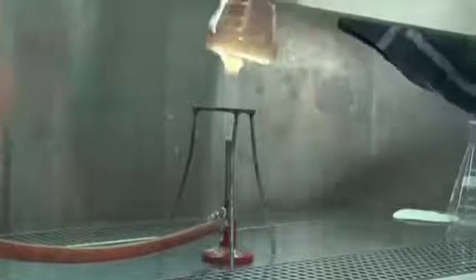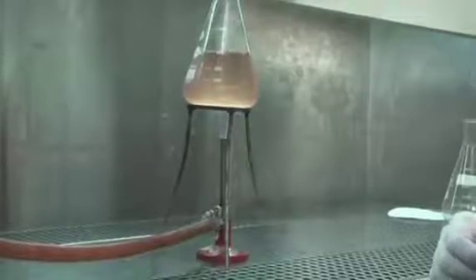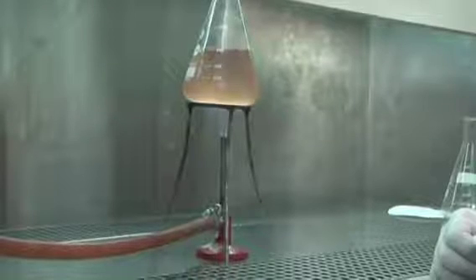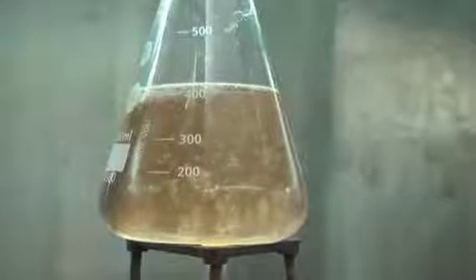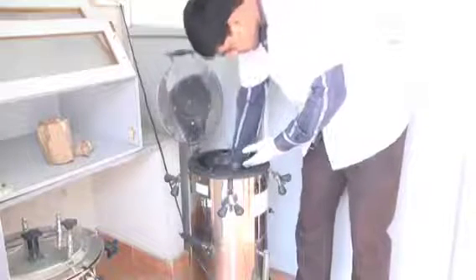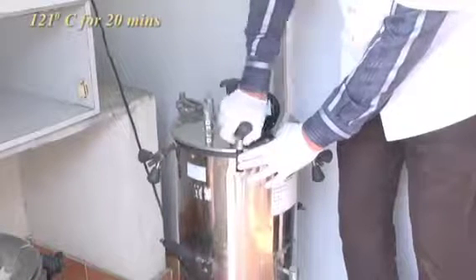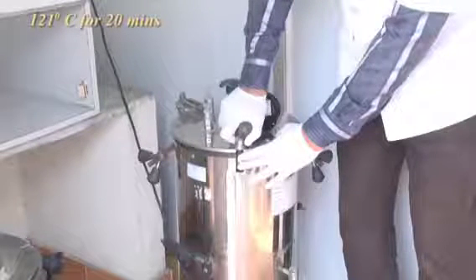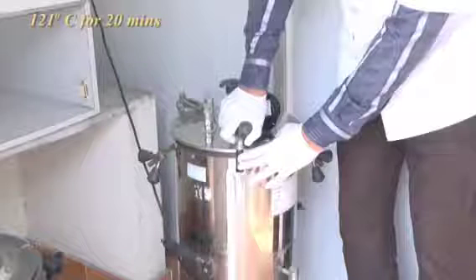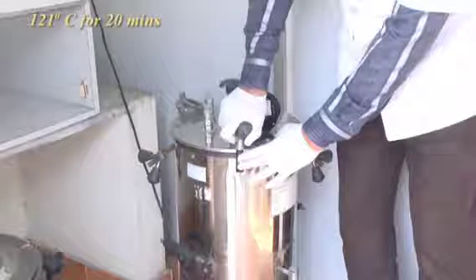Media containing agar should be heated first to completely dissolve the agar before autoclaving. Bring the medium to a boil without burning. Most culture media will require final sterilization in an autoclave at 121 degrees centigrade for 20 minutes, but it is important to follow the manufacturer's instructions as it may vary for different media.